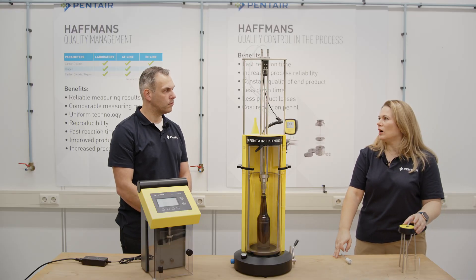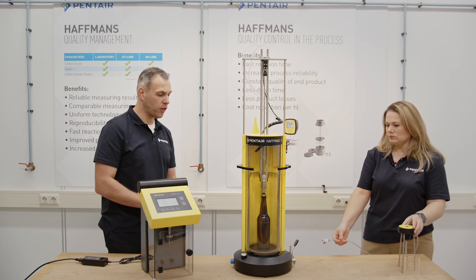So, Frank, can you please show us how to operate together with the FlashAhead? Yes, of course. Thank you, Victoria.